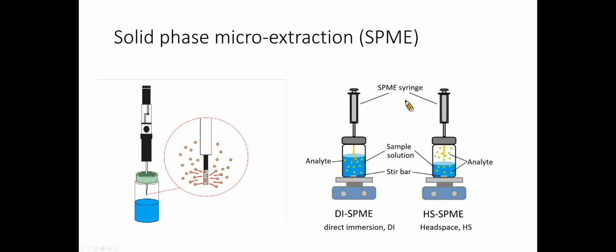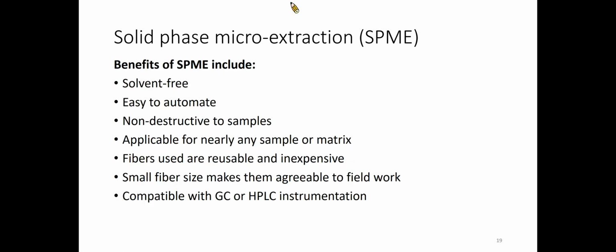Either way, the principle behind SPME is the same, using the partition between medium, like gas or liquid, and the filament, which is solid. SPME combines analyte sampling, isolation, and enrichment into one simple step. By controlling the polarity and thickness of the fiber coating, maintaining consistent sampling time, and controlling several other extraction parameters, SPME allows an analyst to ensure highly consistent and quantifiable results from samples, even when analytes are at low concentrations.